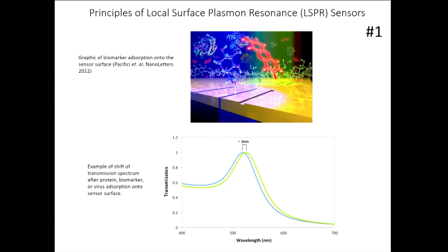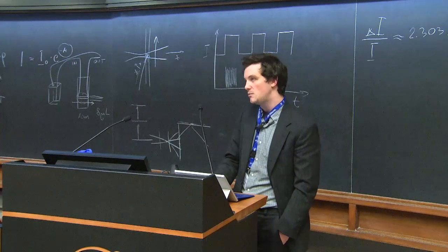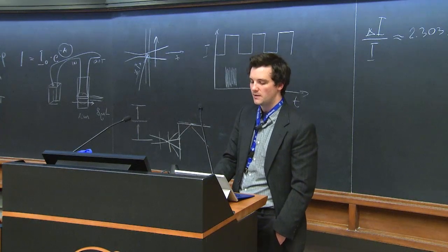So if you were to look at the transmission spectrum of a localized surface plasmon resonance sensor, it would look something like this in the bottom here, where the blue curve represents the transmission before, where the peak is the peak of the plasmon resonance. And after molecules are adsorbed, that spectrum will undergo a red shift by 3 or 4 or 5 nanometers. And you can read them out with a spectrometer, or in the case of this project, I've created a device that uses LEDs and an image sensor to read out the plasmon resonance.